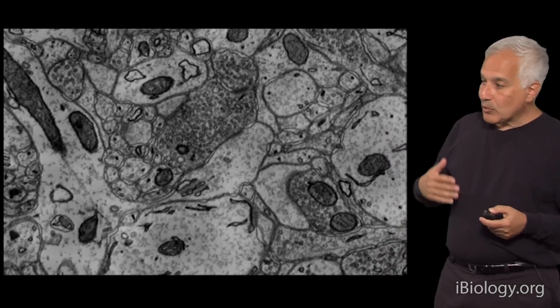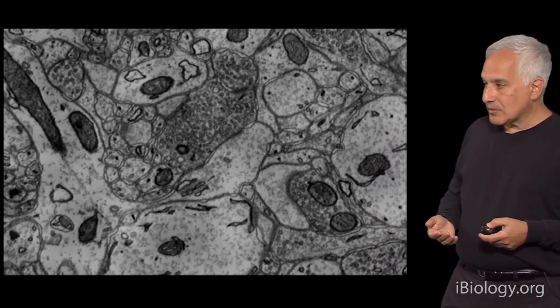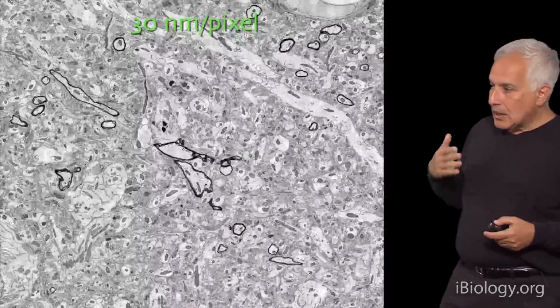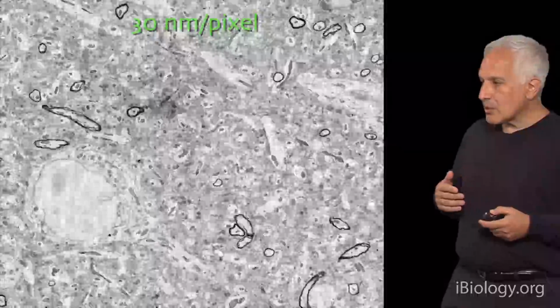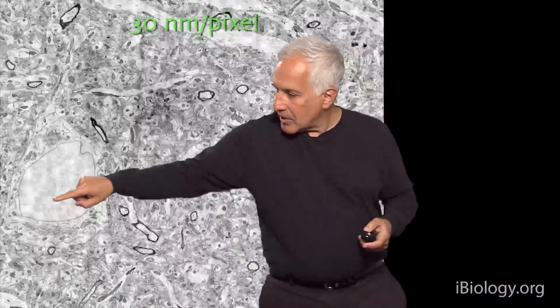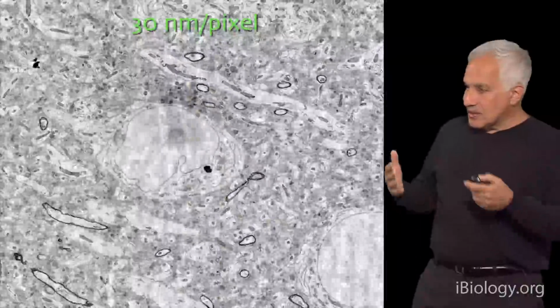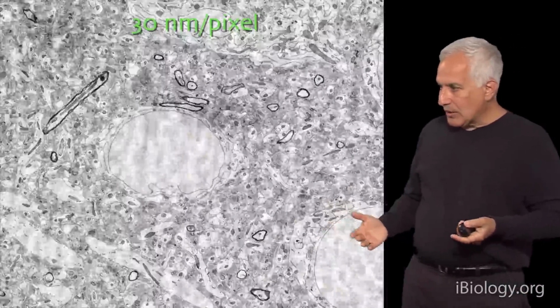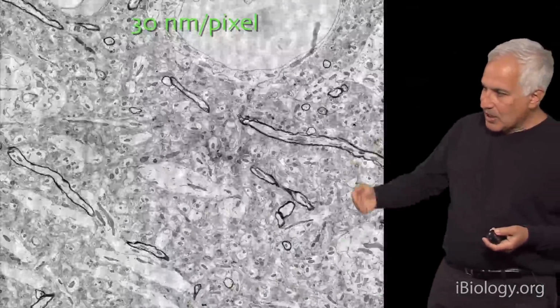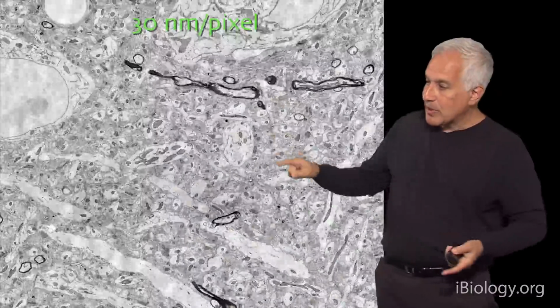So that's one section, but of course, the idea here is to get a wiring diagram. We're going to have to do that section after section. So here is, at low resolution for us, 30 nanometers per pixel, a series of several thousand sections that we're going through. And you see cell bodies being cut, like this big object here, and that's the nucleus of the cell body, and all this stuff moving around. And obviously, this is from plastic. Nothing is actually moving. This is not a time-lapse image. It's a space-lapse image. We're going from one section to the next. And as the wires pass through the sections, they appear to be moving from one place to another.